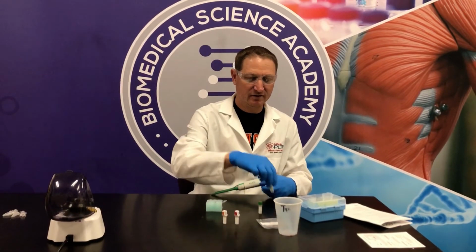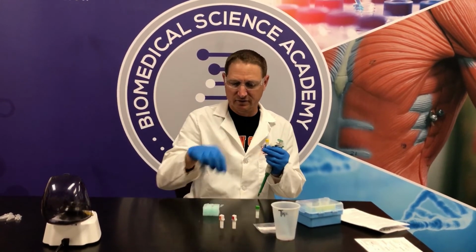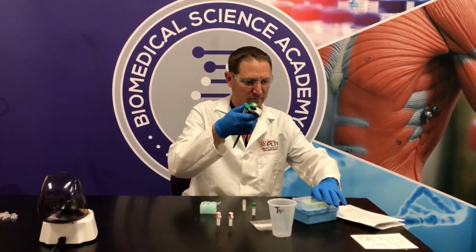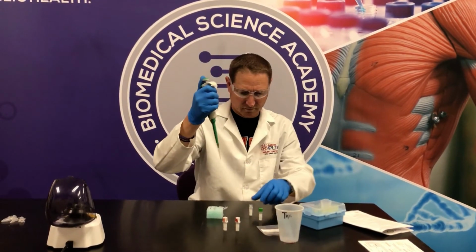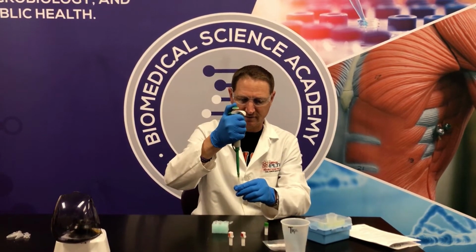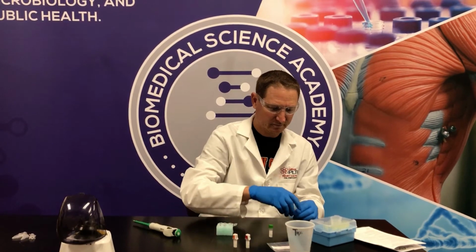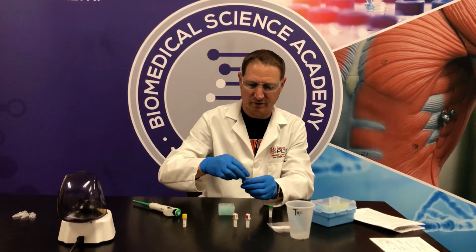Okay, the next step is to take your missing person 1. You're going to aliquot 35 microliters into your microtube that is marked 1. So double check, missing person 1, 35 micros. And cap it. And let's cap this as well.